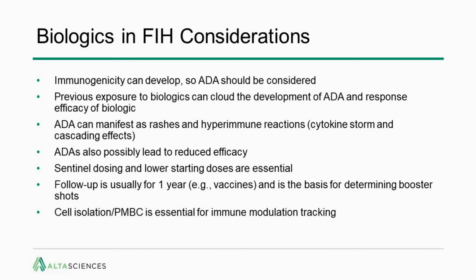And now if that same participant returns and participates in a different biologic study, well, now you've got two very complicated exposures to sophisticated biologic proteins, and how their ADA will react to the new biologic is a concern. It can also make it difficult for the bioanalysis portion to understand: is this the development of ADA to this current biologic, or is this an exposure that has already occurred and now we're looking at an ADA that was formed previously, and the currently studied biologic isn't the one that's causing the development of these antibodies?